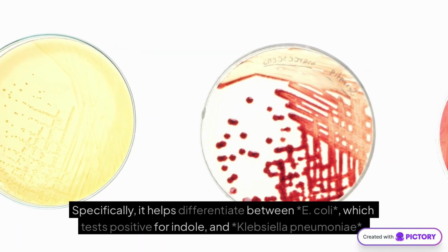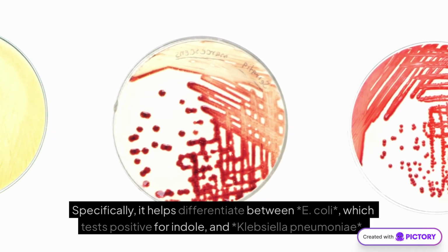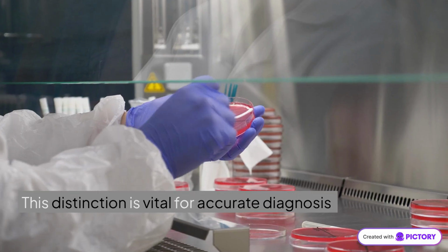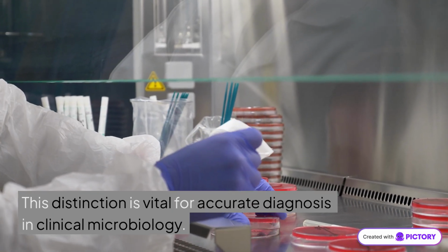Specifically, it helps differentiate between E. coli, which tests positive for indole, and Klebsiella pneumoniae, which tests negative. This distinction is vital for accurate diagnosis in clinical microbiology.